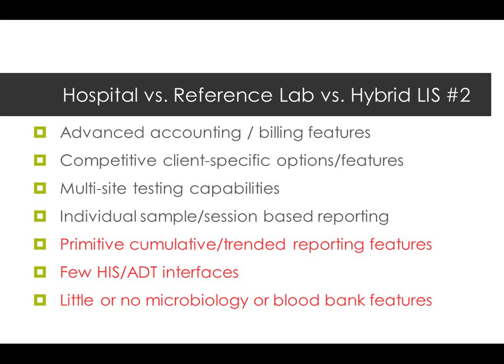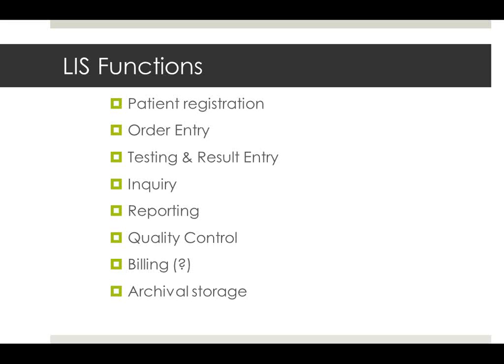And up until recently, they didn't much need microbiology because reference labs didn't typically get a lot of microbiology. The samples were too unstable to ship them out to a reference lab. And they didn't have blood bank features because they didn't have blood banks.